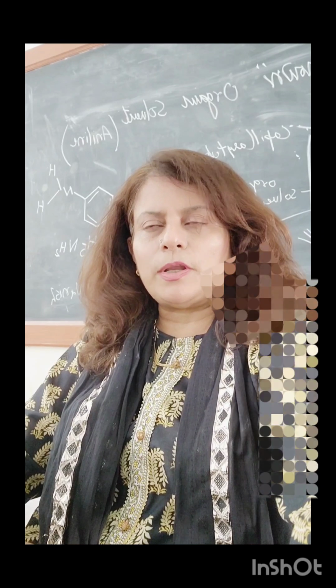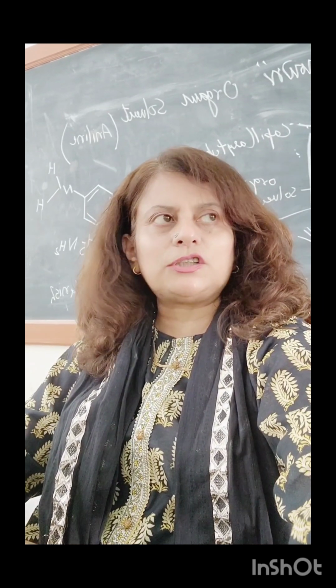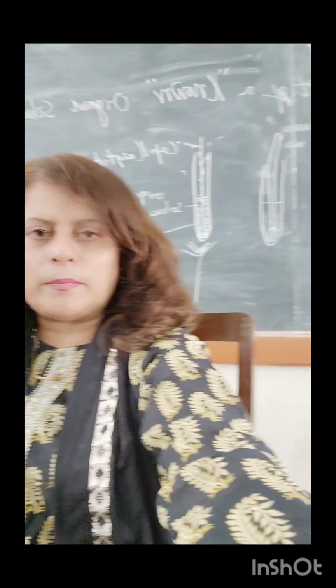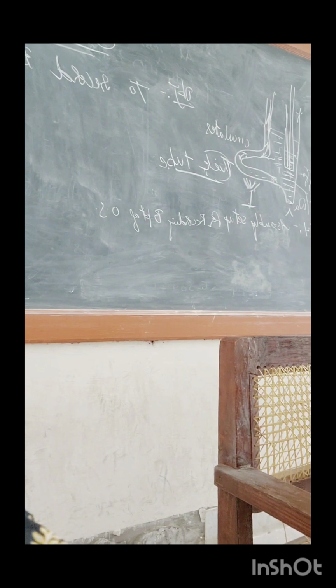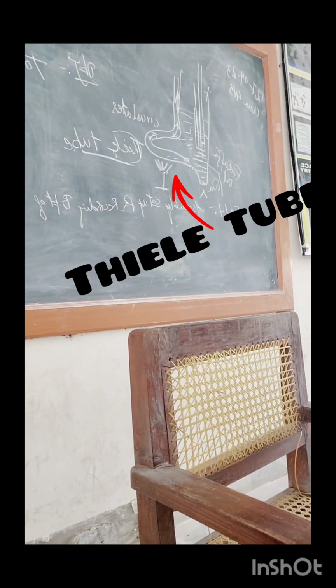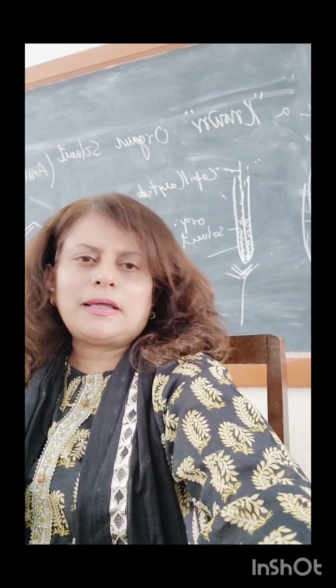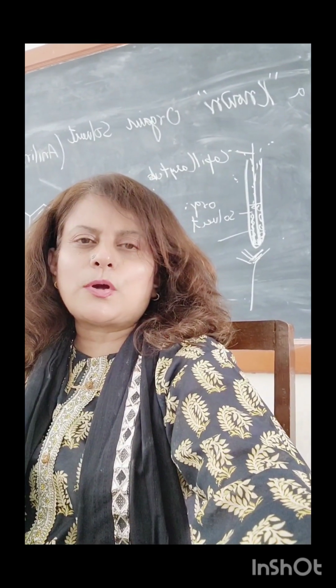And welcome with another video. I'm in my BS Part 2 lab, organic chemistry major, and I just explained to them the 4th experiment. You can see behind me a blackboard on which I have explained to my students how to use a Thiele tube. I even explained how you're going to heat the arm of the Thiele tube, and then how to record the boiling point.